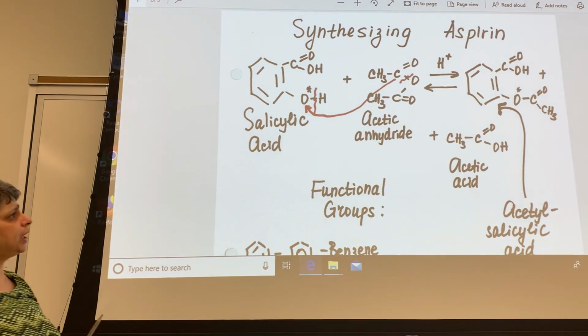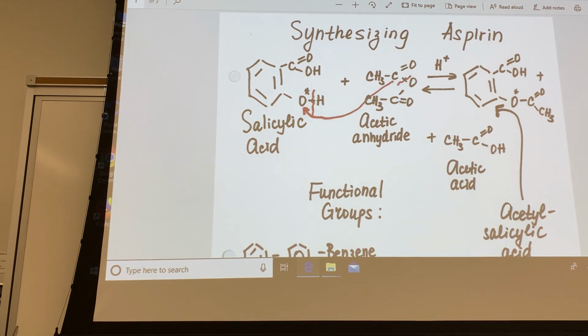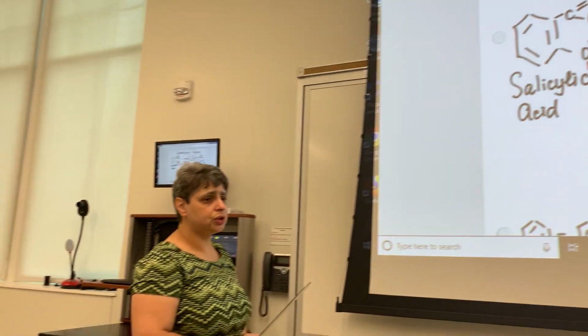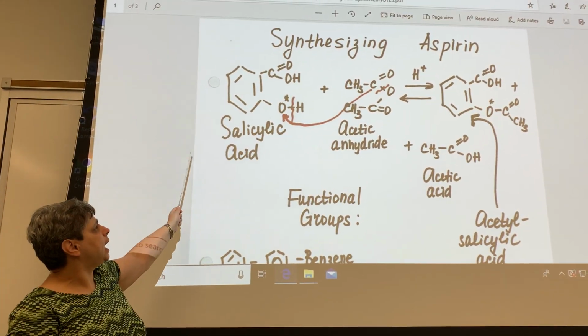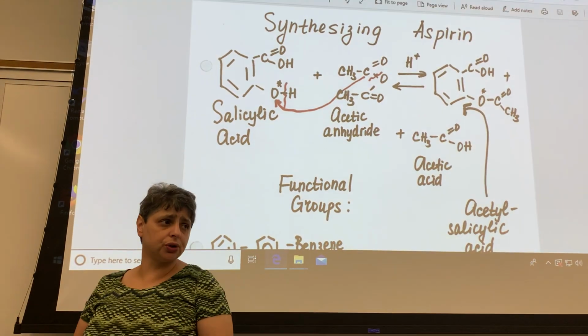And so we're going to take our crude product, we're going to add some ethanol, possibly with a little bit of heating to help it dissolve faster. I would point out that because ethanol is used, ethanol is flammable, so no Bunsen burner should be present, no open flames, period. Only a hot plate should be used to warm up the mixture. So when we add ethanol to our crude product and heat, both salicylic acid and acetylsalicylic acid will dissolve.